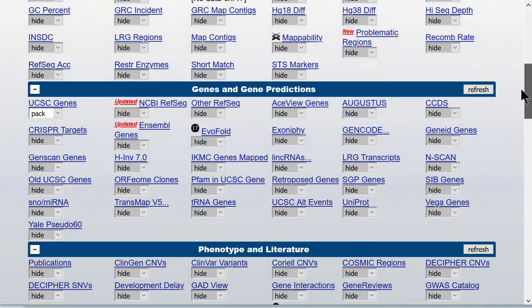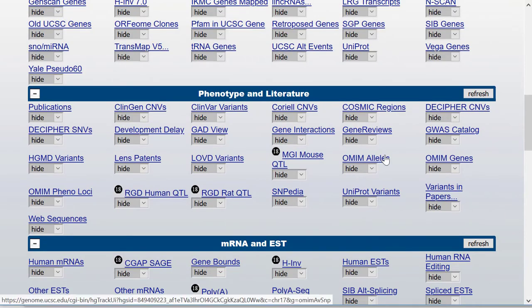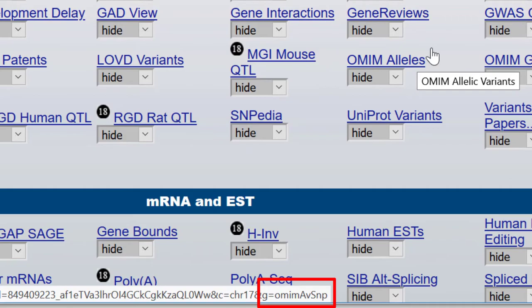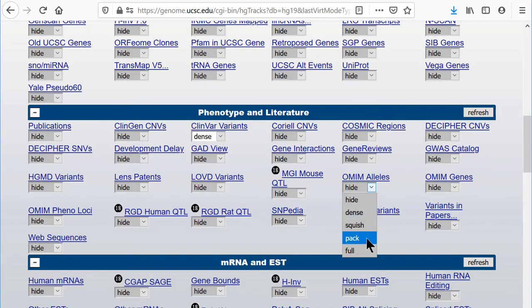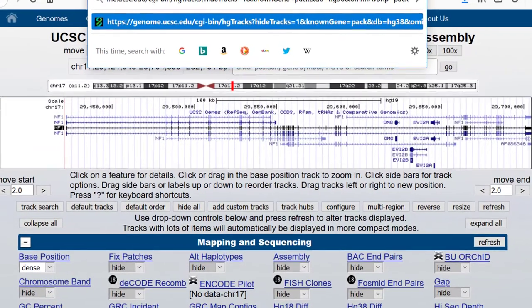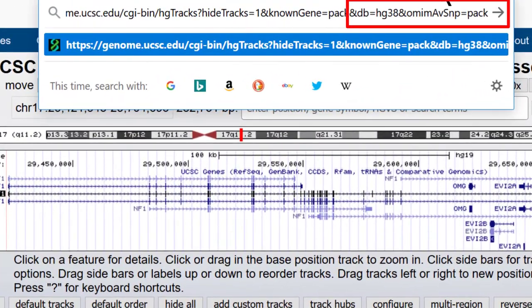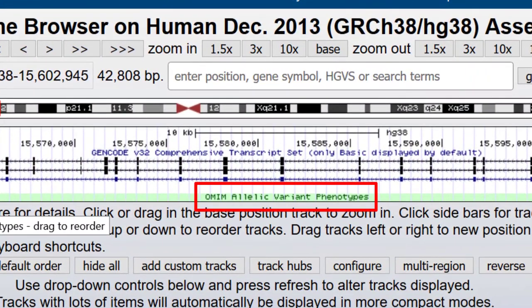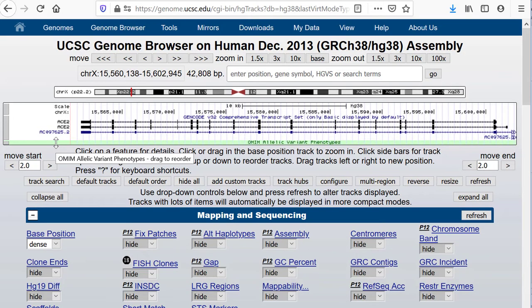Let's add the OMIM Alleles track from the phenotype and literature group using table name omimAvSnp. We can set a track to any visibility level in the drop-down menu — we'll use pack: ampersand omimAvSnp equals pack — and return to hg38. This gives us the URL as shown. Two tracks are turned on, albeit there are no data in the OMIM Alleles track at the ACE2 gene.